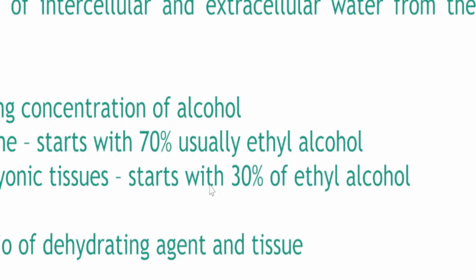Those three things. DDDP. Ano yung DDDP kanina? Sabi natin? Ano yung DDDP na pine-prevent fixatives? Patay, nakalimutan na nila. Because if there is water, DDDP can happen. Ano na yon? Yung may putrefaction kanina. Ano na? Decomposition. Ala, class.